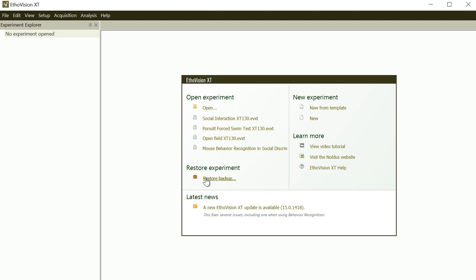In this video, we will click this, and let me mention here, if you try to start up this software, first you will be prompted to input some information. There would be a pop-up window which enables you to input your email address and trial key code.